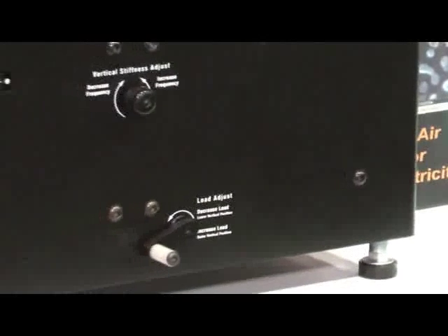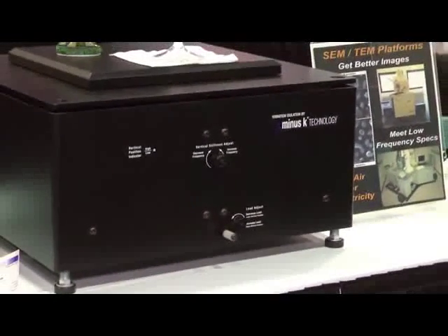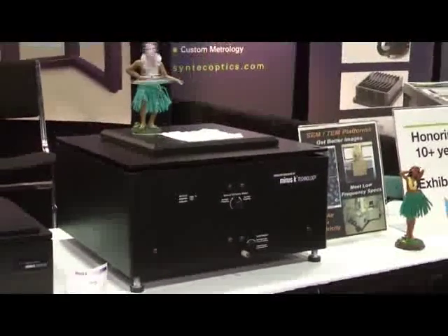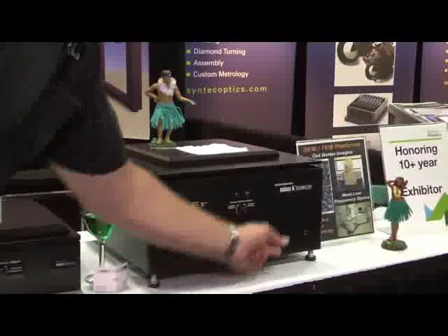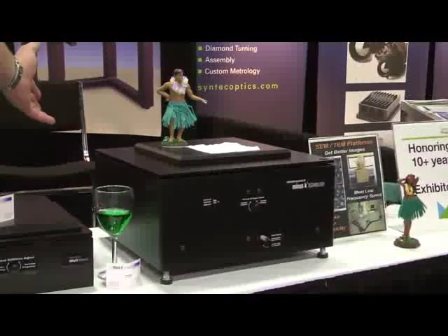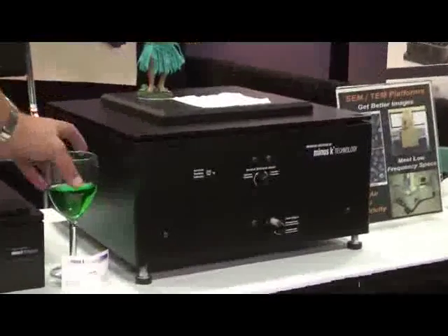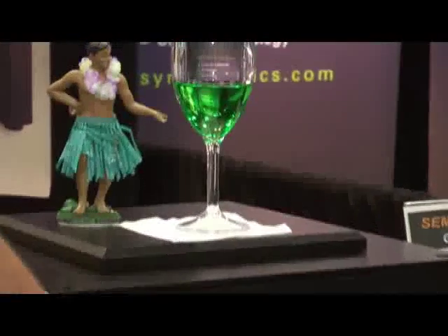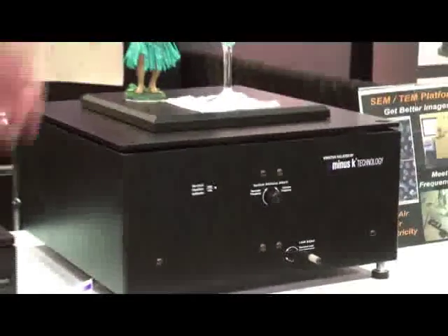When you take them out of the box, you have three leveling feet. You use the leveling feet to get the isolator basically level. You put your payload on. If you change the mass, that's the only time you really have to interact with it. Say you take some weight off — now it's sitting against the upstop. What I'm going to do is adjust the load adjust until we get it floating again. It's that easy. I've just now readjusted the passive isolator to offer the same level of performance with the weight change. Similarly, if we put weight back on, it's going to drop down because it's a passive system. However, all we have to do is use the load adjust again, just a few turns. There you go. It's just that easy.